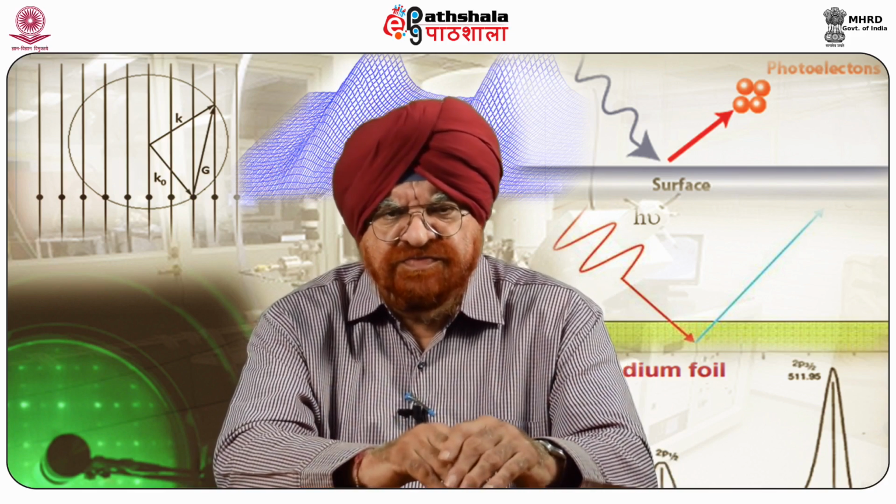Each electron is held in place by the nucleus with a characteristic binding energy. X-ray photons of energy h nu collide with an electron. The energy of the photon is imparted to the electron, and if this energy is greater than the binding energy, the electron will leave the atom and carry with it excess energy in the form of kinetic energy.